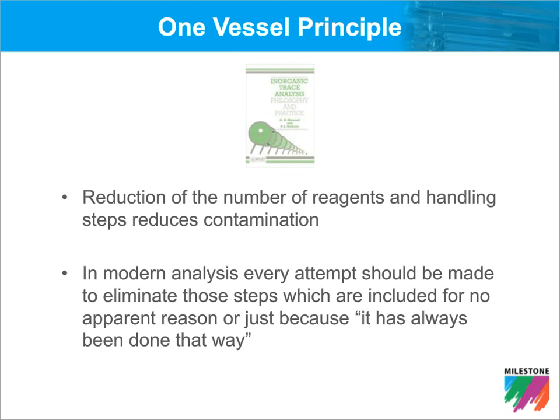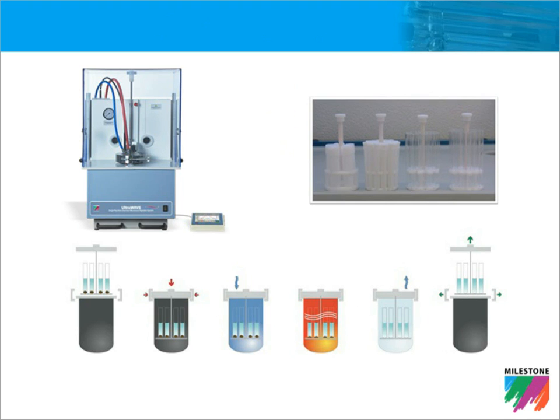Finally, we discuss the one vessel principle. The idea here is to keep the sample solution in one and the same vessel during all analytical steps. We have demonstrated how the one vessel principle is implemented using the UltraWAVE with a single reaction chamber. This reactor is a large pressurized stainless steel reaction chamber into which all samples are placed and digested simultaneously.